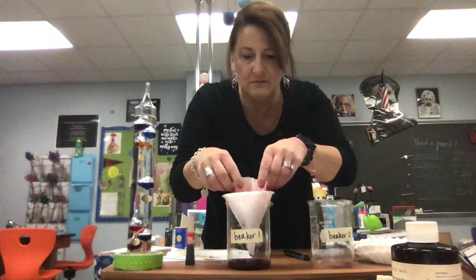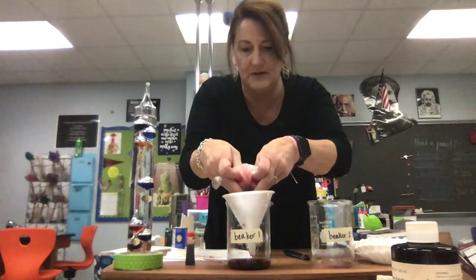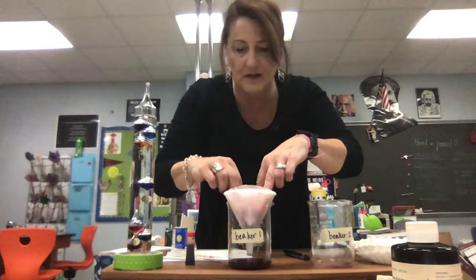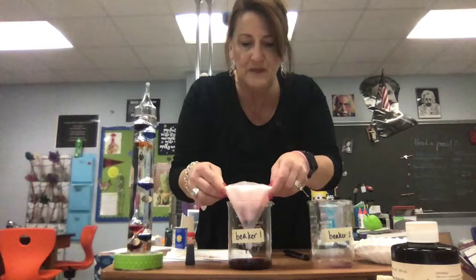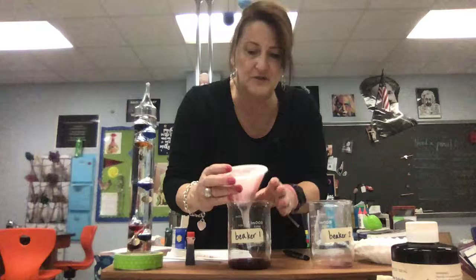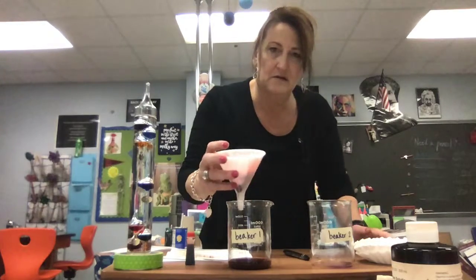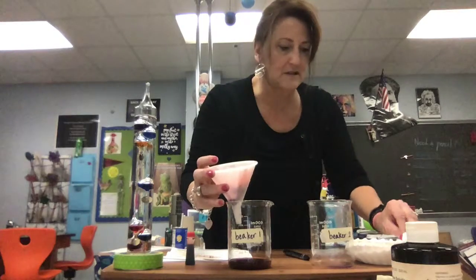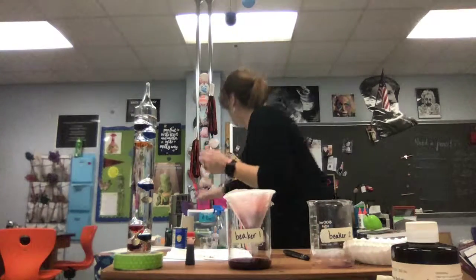Come on. I'm going to try to speed up the process. Okay, so let's see. The filter paper looks like, all right, that's not going to work. Let me get a paper towel.